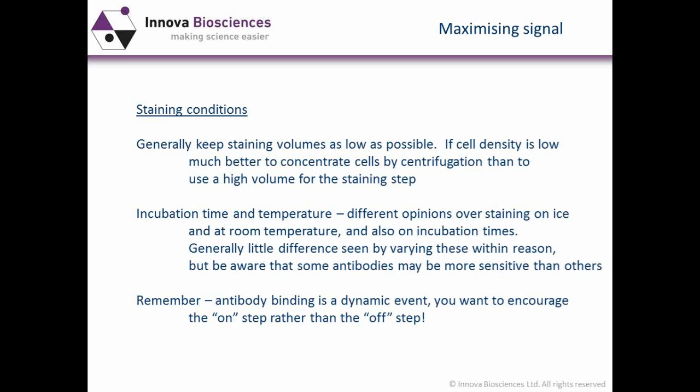I certainly wouldn't recommend trying to undertake your staining in half a milliliter or 1 milliliter, even if you think you're using the same number of cells. Remember there, effectively your antibody will be very dilute, and the reaction with the cells will be significantly reduced. It will certainly be much slower.